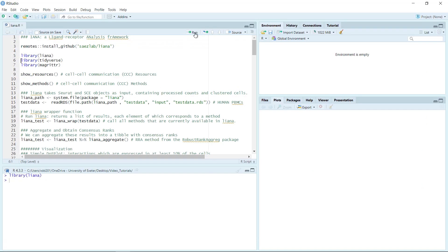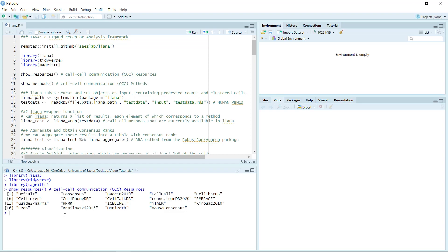I loaded the package already. First, you can use the showResources function to see how many cell-cell communication resources are available in the current version. This package is under active development — in future they will add more resources and methods. Let's have a look at the resources. At the moment, the package I installed has 19 resources.